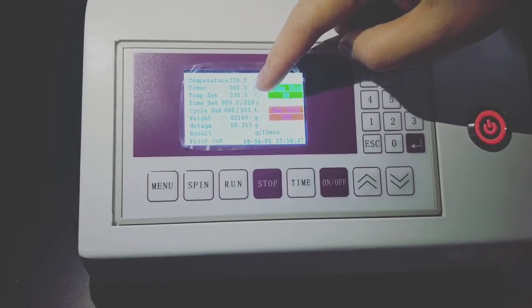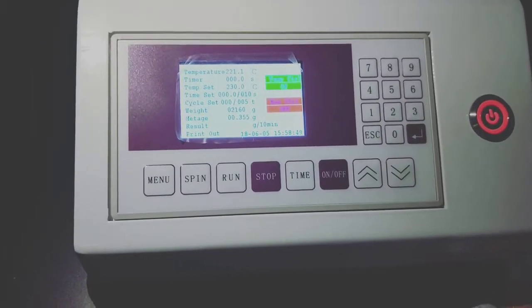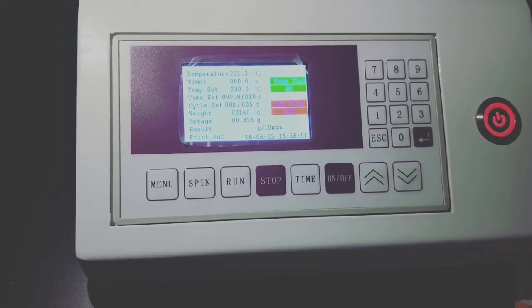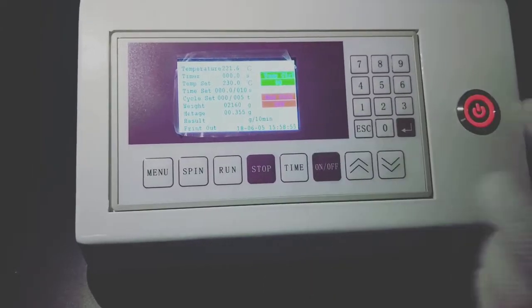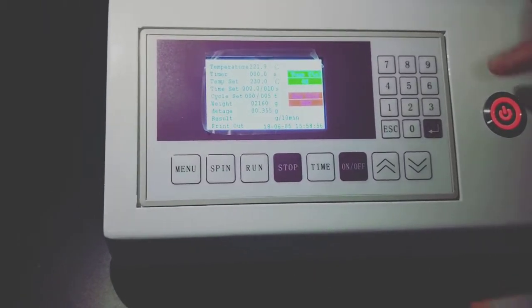And this time set is used for automatically cutting every 10 seconds. If the melt flow index value is small, we can set this time a little bigger, like 20 seconds or others.